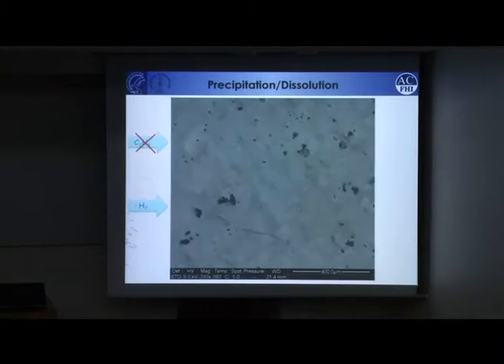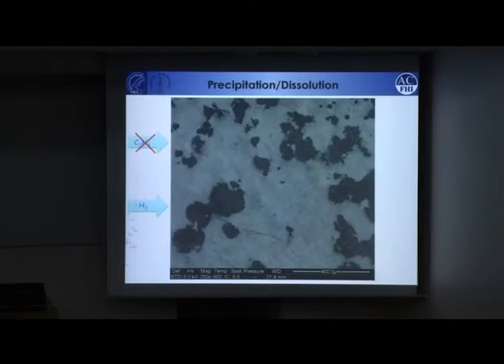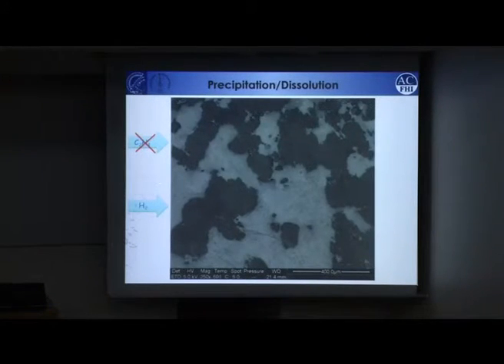The funny thing is when we turn off the hydrocarbon and introduce the hydrogen back into the chamber, it takes a while until the atmosphere really exchanges. But once the hydrocarbon is out and just hydrogen is in the chamber, it seems to reprecipitate the carbon back from the volume to the surface. See, everything is getting dark again.